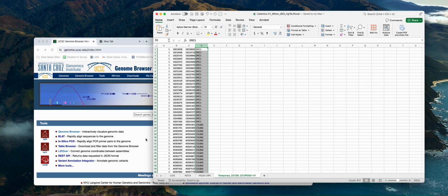And so I want to convert this over to HG19 coordinates because we are going to use an Illumina alignment system module called an enrichment module, and it happens to just be scripted to look for an HG19 genome on the machine and to use that for the alignments. So I need these coordinates in a different build of the genome. And so this is how to do that.